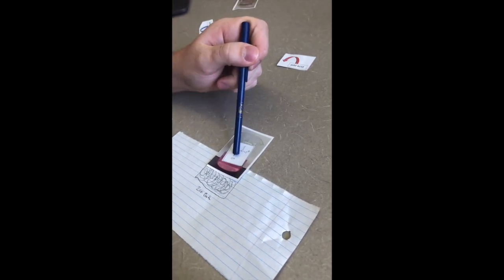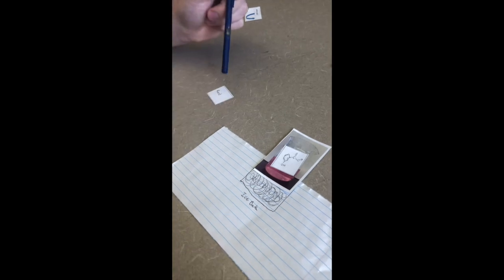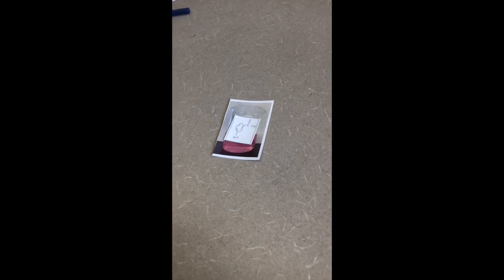So we're going to take our stirring rod, dip it into the mixture, and then we're going to touch our pH paper rather than take the pH paper and dip it into the mixture. So we're looking for a red. So now we have our crude acid, and we can go on to recrystallization to get those pure crystals.